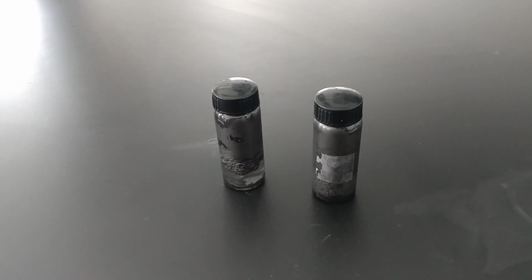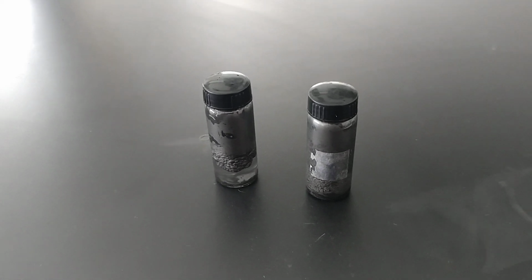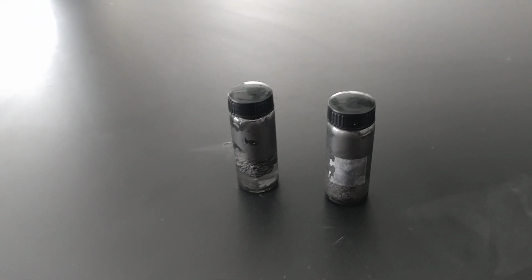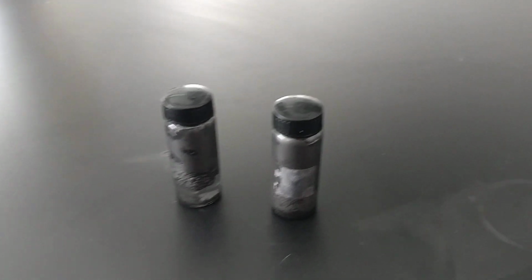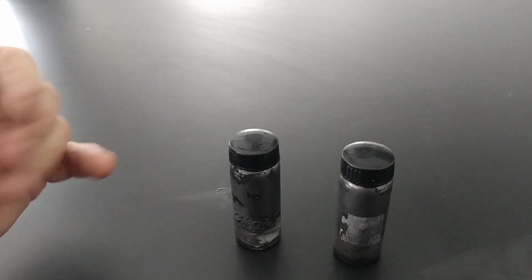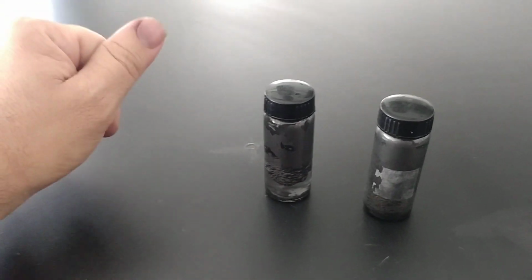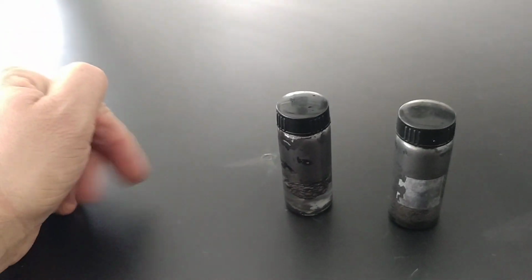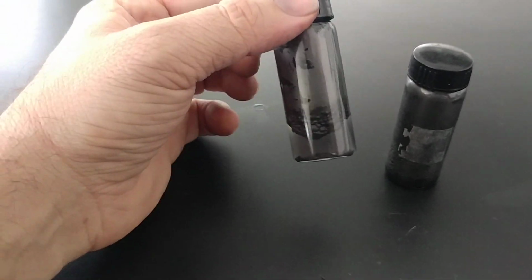But luckily, I just got back from the Graphene conference in Xi'an, China, and it's a giant conference. And I met with a professor that does these tests and figured something really neat out. And that is that if you mix water 50-50 with an oil or non-polar solvent that is not miscible with water, in other words, it won't mix, gasoline is a pretty good example. And right here I have octane with water, and you can see what happens here.